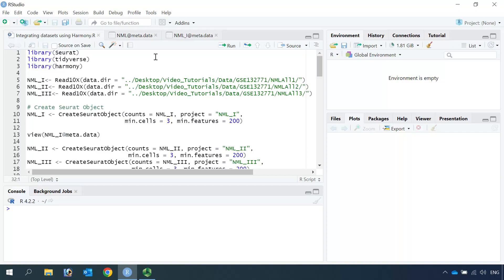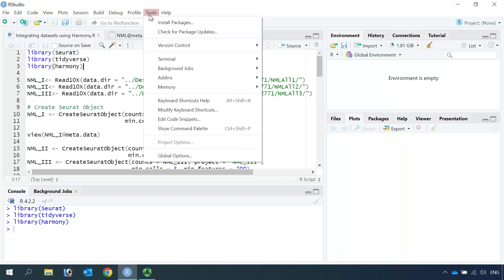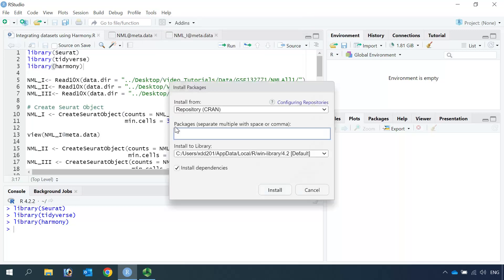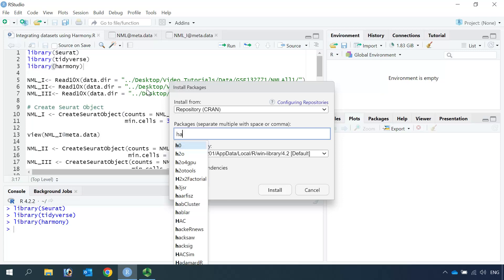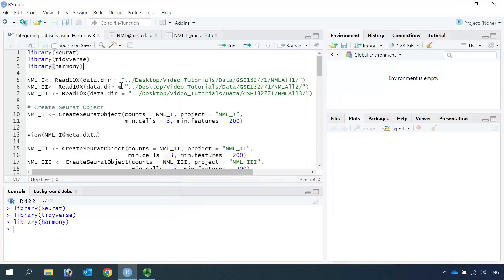First we need to load our packages: Seurat, tidyverse, and Harmony. If you haven't installed the Harmony package, you can go to Tools, then Install Package, and type Harmony. You can find the Harmony package to install. Because I installed it already, I just need to load the package.